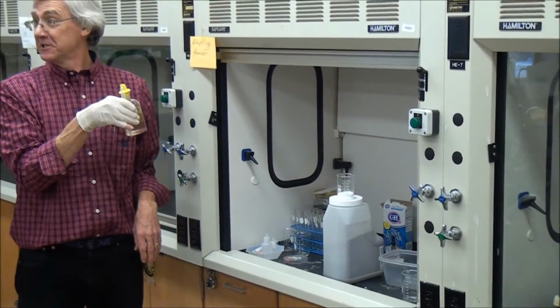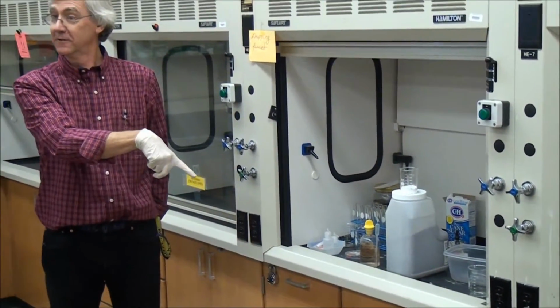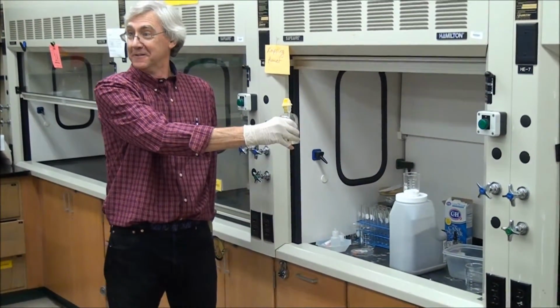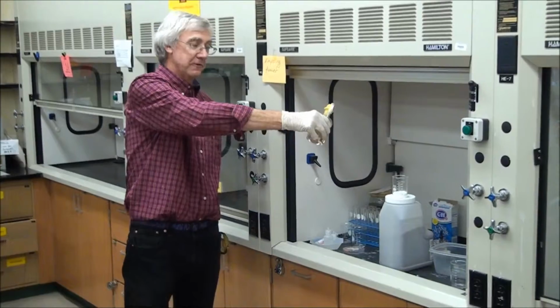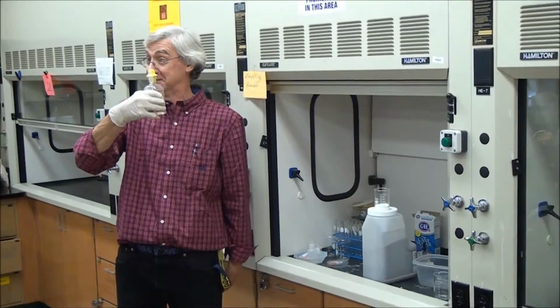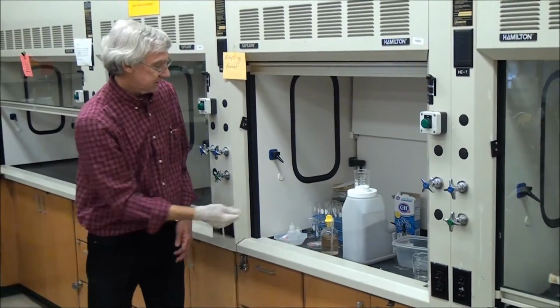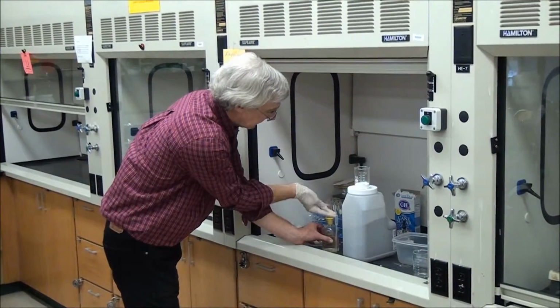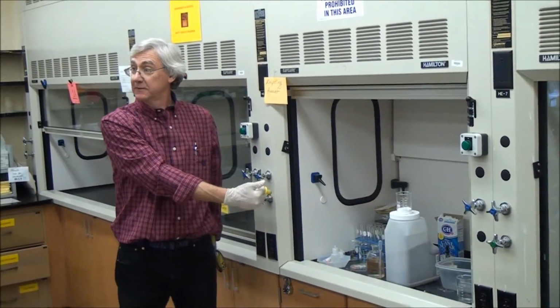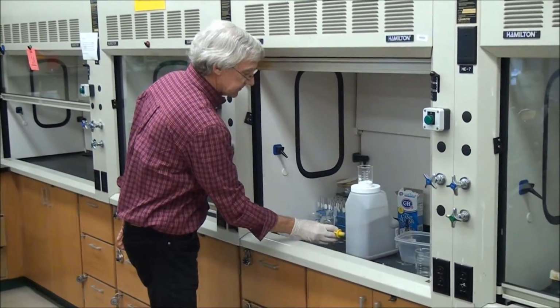If you do happen to handle one of these things, gloves are nice. Otherwise, there's going to be a label on there. You should always grab it so your hand is over the label. If everybody does that, when you pour from it, everybody's going to pour out the other side, and if there are any drips, they're all going to go down here where your hand is not. We don't want to contaminate things, so if we take a top off, we don't want to set it down on a dirty, crappy tabletop, so oftentimes we can just hold on to it. And what we're going to do is we're going to just pour.